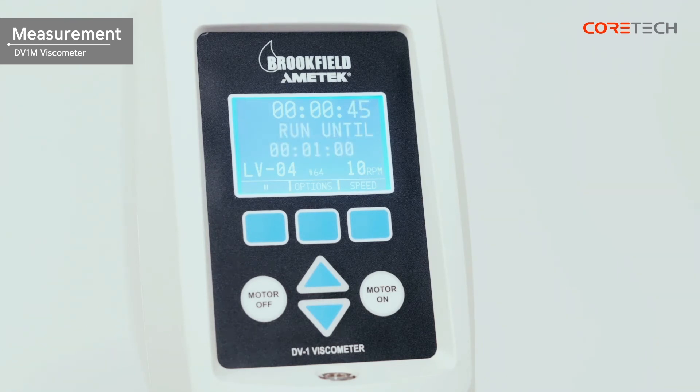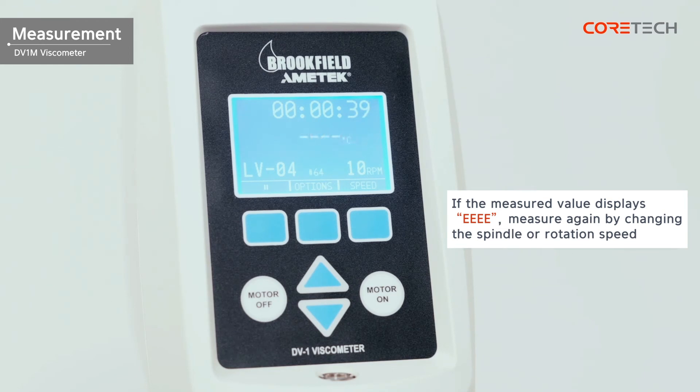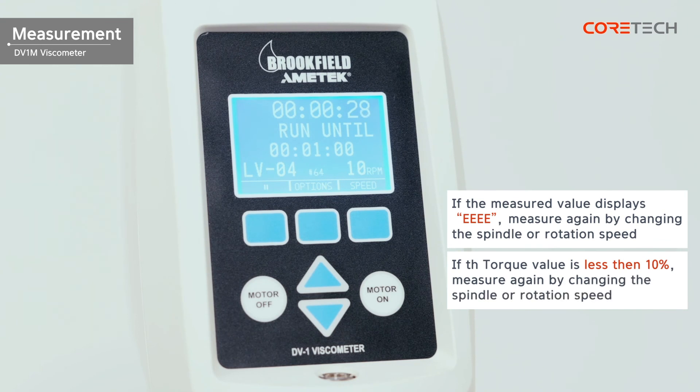If the measured value is not displayed and 'EEE' is shown, the measurement range is exceeded. In this case, change the RPM to measure again, and then replace it with a different spindle. If the torque value is less than 10 percent when the measured value is stabilized, the correct viscosity value cannot be obtained. Therefore, change the spindle or rotational speed and measure again.